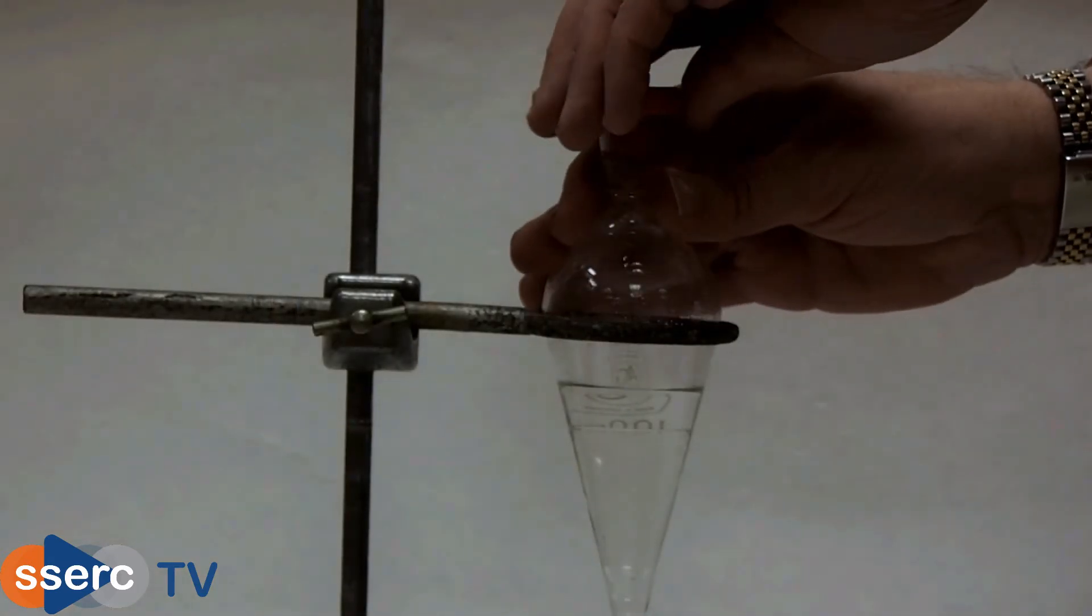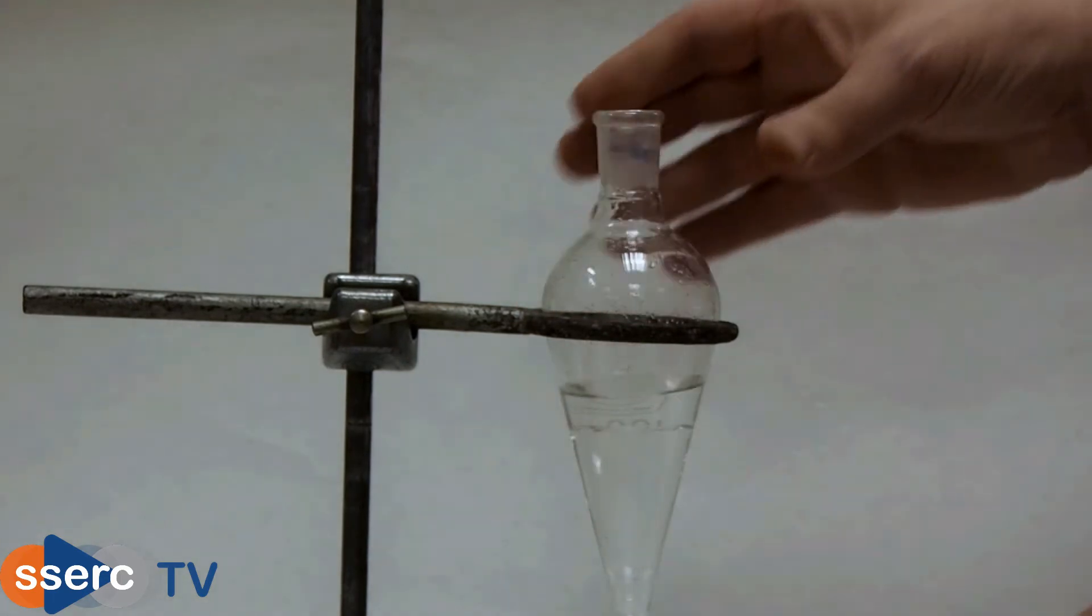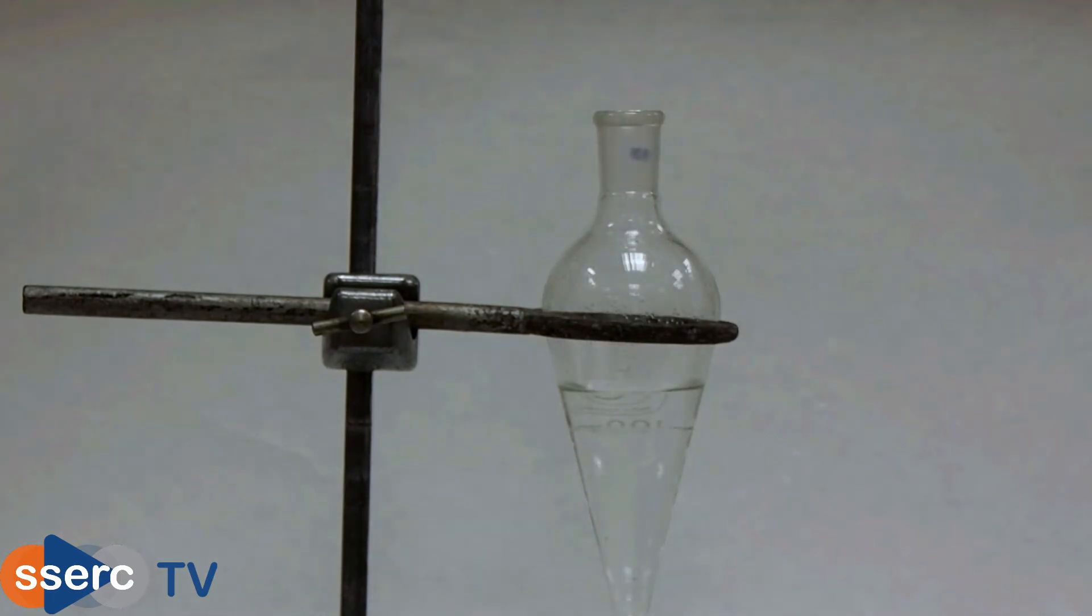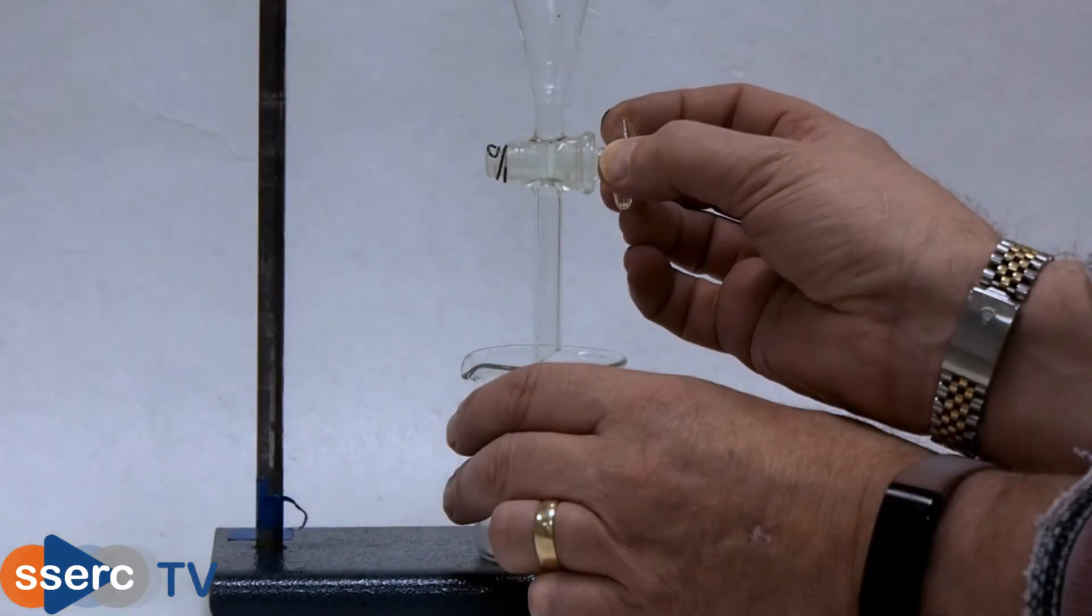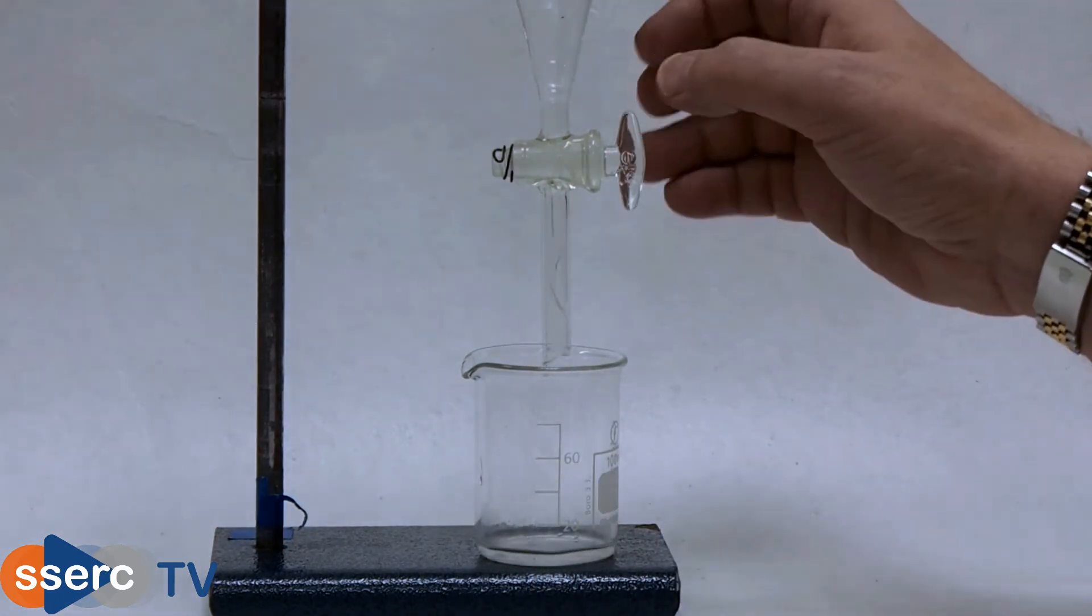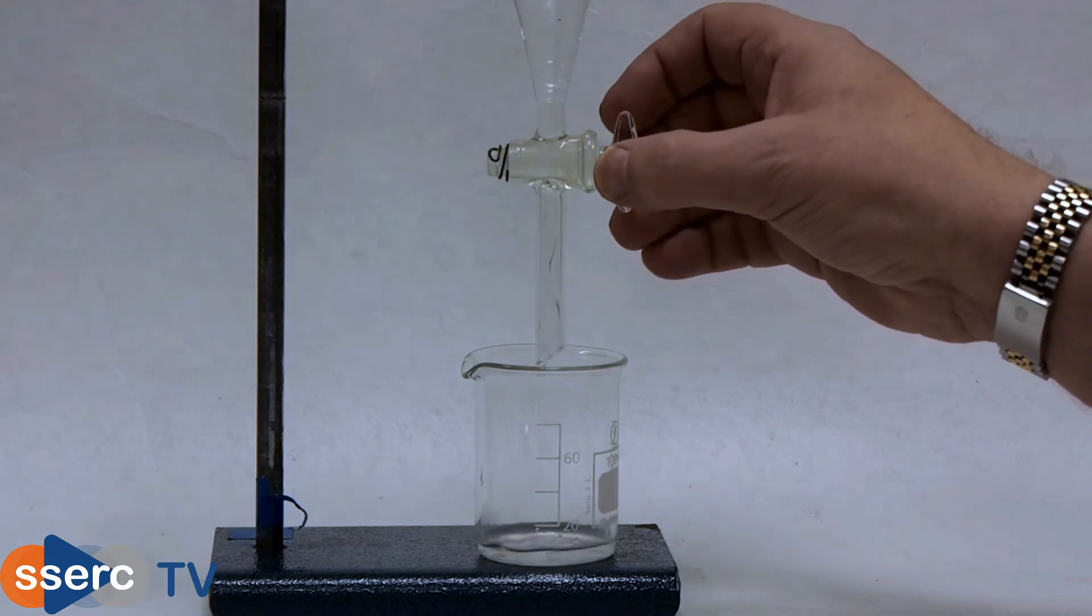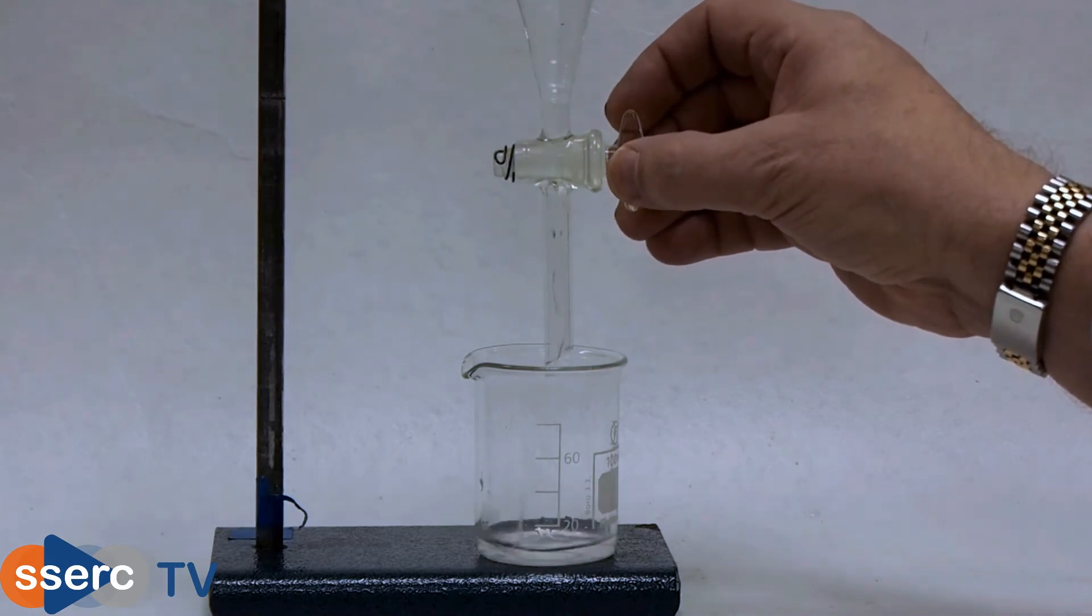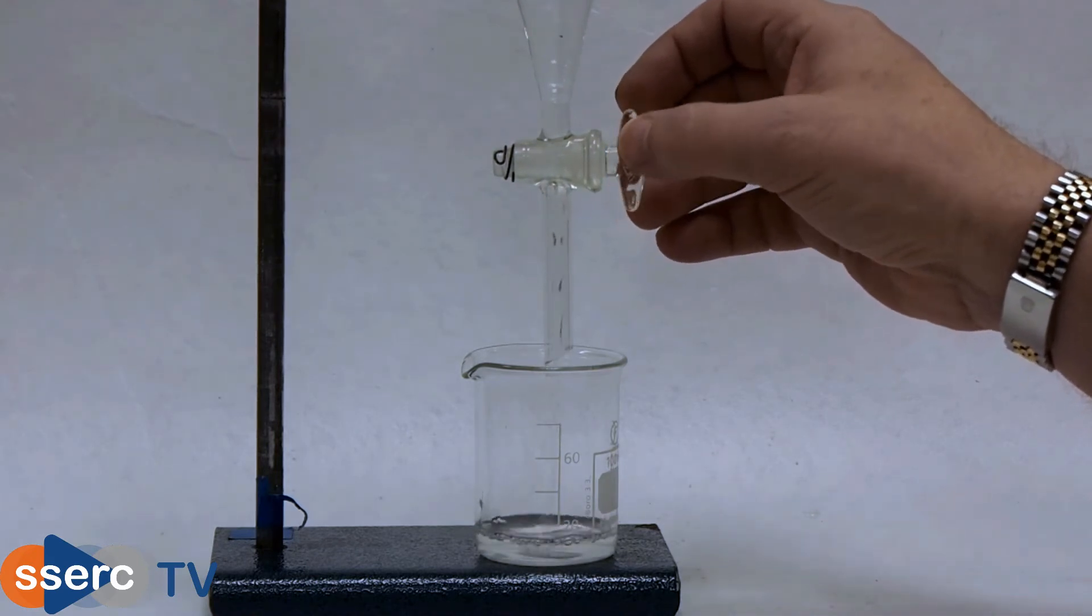Remove the lid or the vacuum will prevent anything coming out and turn the tap to run the bottom layer into a beaker underneath. When the interface between the liquids is near the tap, the narrowing of the funnel means the level drops more rapidly so you need to take care. It is possible though to manage to separate the two layers exactly.